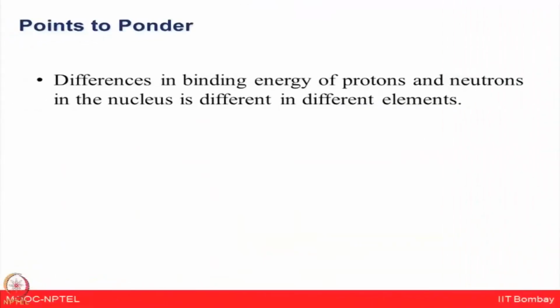As a consequence, since we can't be sure we've got the right answer, let's at least estimate what our error rate is. And so I'm going to talk to you about calculating a false discovery rate from this type of thing.